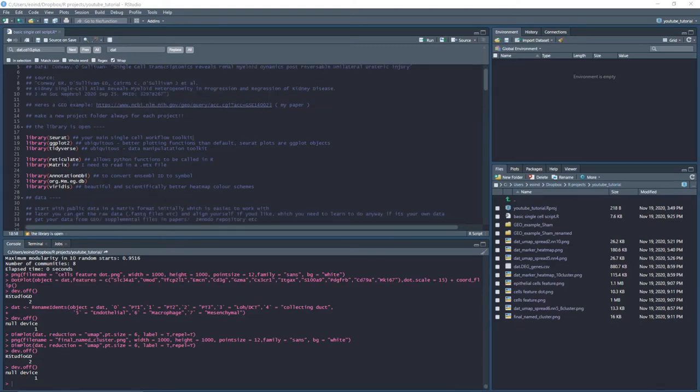So I'm going to assume a basic level of familiarity with R, but I'll talk you through some of the trickier bits. To begin with, you need to ensure you have the correct packages open. So start a new folder and make sure you have installed the packages you see listed here. Specifically the first 3 are the most important, but you'll likely need all of these if you want to follow everything through just as I provided the code.